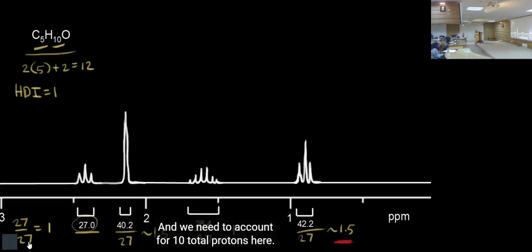We might have 3.1 or 2.9, but we have to round this up. Definitely there is no 3.1 proton or 2.7 proton. There might be a problem in integration if you do not select the correct area for integration, or there might be some impurities behind your signal in small quantity that you cannot identify.